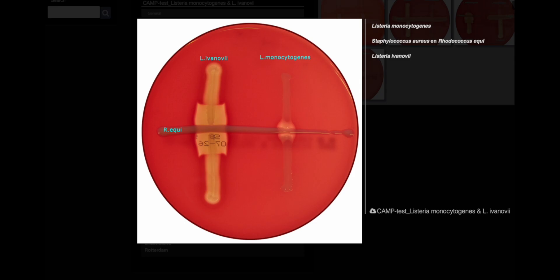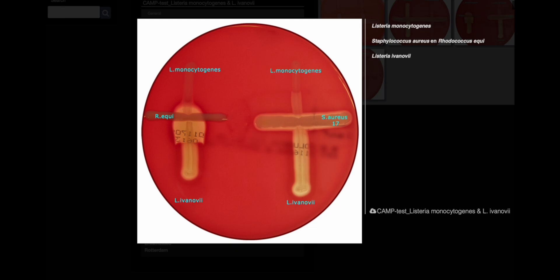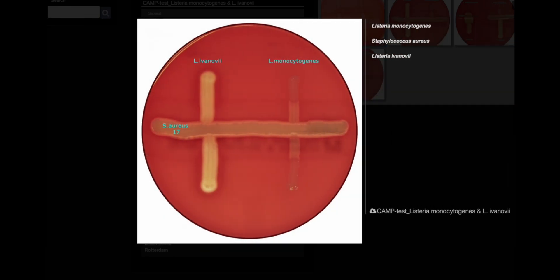These two streaks L. monocytogenes, and to a lesser extent L. seeligeri, show enhanced hemolysis near S. aureus, while L. ivanovii exhibits increased hemolysis close to the R. equi streak. It's worth noting that the CAM test's reliability has its limitations.